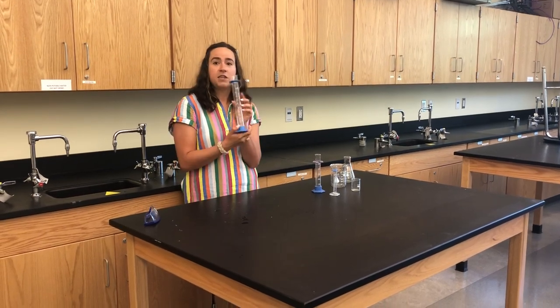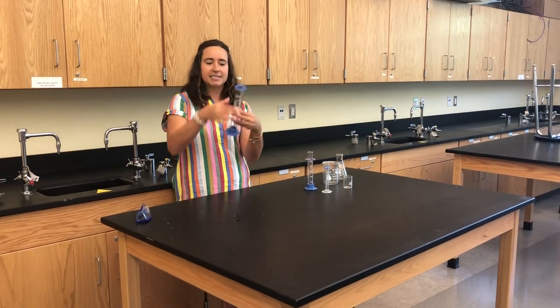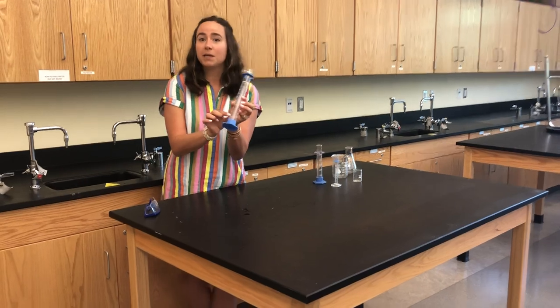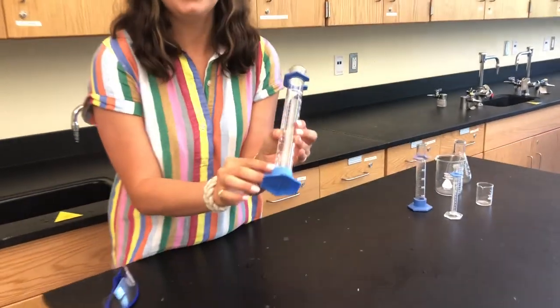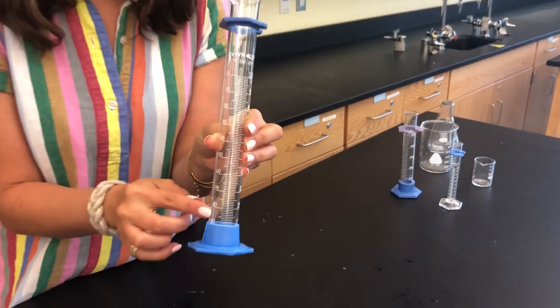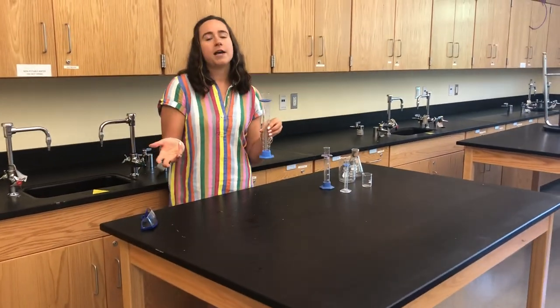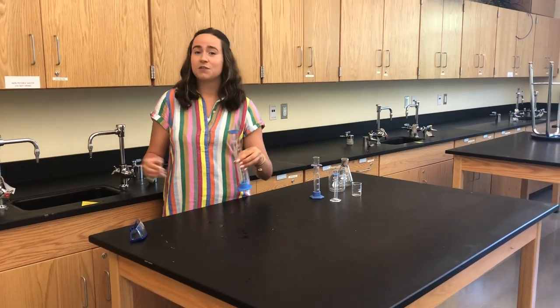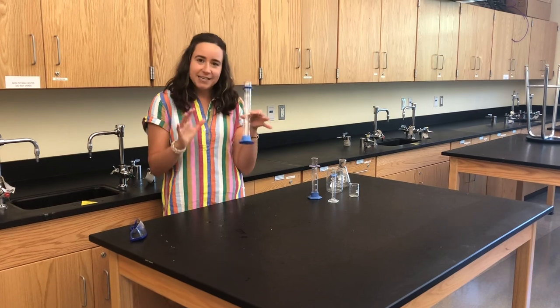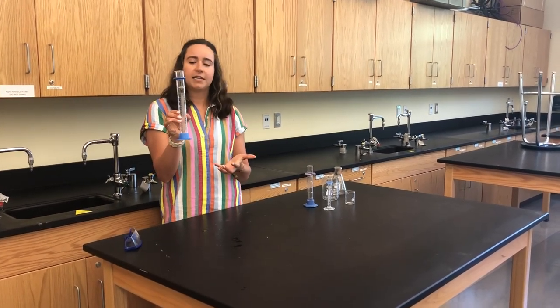Let's get started by talking about this one here — this is called a graduated cylinder. 'Cylinder' because it has that cylindrical shape, and 'graduated' because it has these little markings that tell us how much liquid is actually inside. A graduated cylinder is used for measuring liquid, so anytime you're asked to measure out 100 milliliters of water or 10 milliliters of acetic acid, you will use a graduated cylinder.